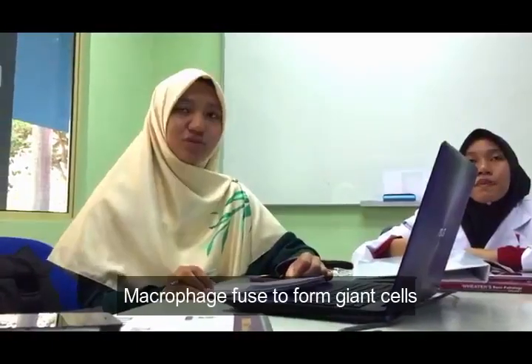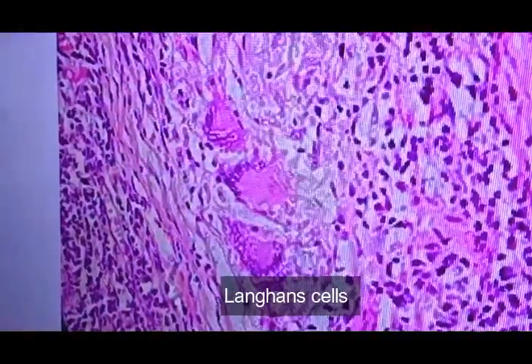Okay, in the next slide, we can see the macrophages fuse to form giant cells. The typical giant cells for infectious granulomas are called Langhans cells and have the nuclei lined up along one edge of the cell.